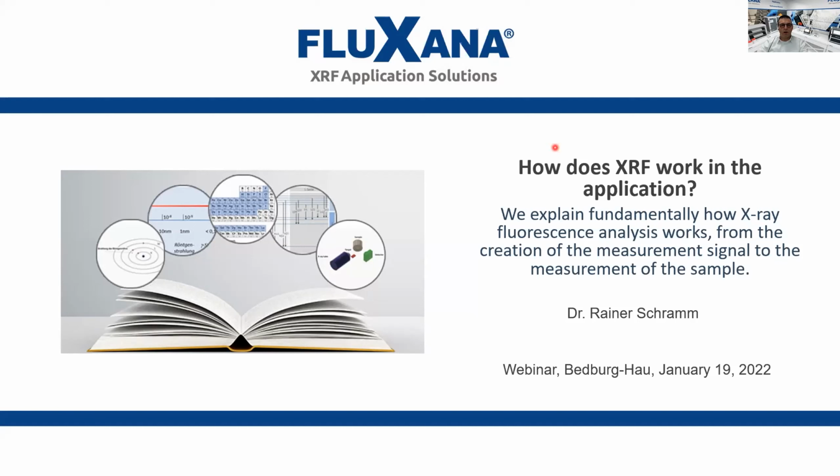And today I would like to start with the basic explanation of how XRF works in the application. So mostly for those of you who are new to the field and just want to know how XRF is working. My name is Rainer Schramm. I'm the CEO of FLUXANA, and I would like to take you through it today.